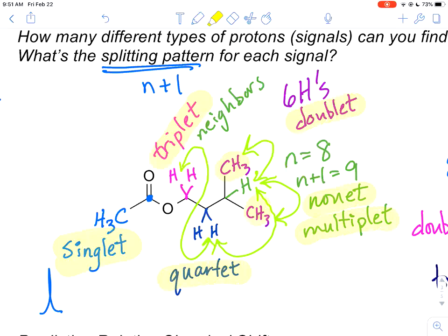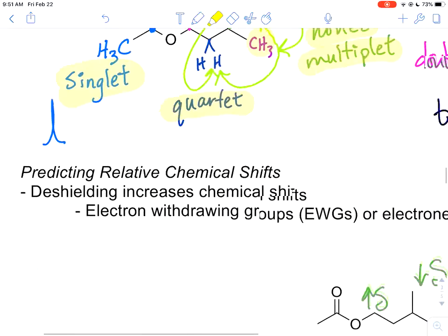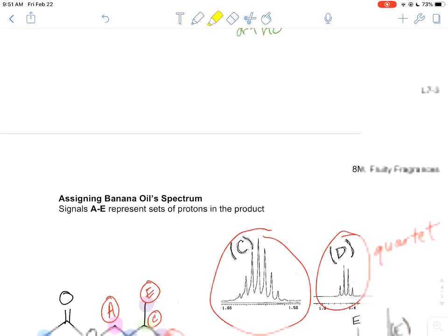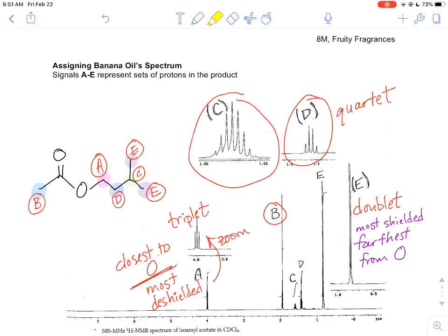We then applied that and used just the splitting patterns to assign the spectrum. The next page of isoamyl acetate. This guy is given. We identified, hey, look, we had a triplet, so that must have been signal A.